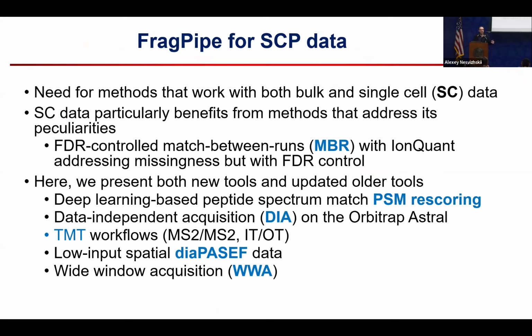I really like the single-cell proteomics community because it's really pushing the envelope and helps us computational scientists to develop new tools and new strategies. Even if at the end, the way we analyze the data for single cell is not necessarily that much different from analyzing bulk proteomics data, it pushes us to optimize the workflows, because everything that we optimize for single cell benefits pretty much every user. So we need methods that work with single cell as well as with bulk proteomics data sets, ideally through the same workflow, the same pipeline.